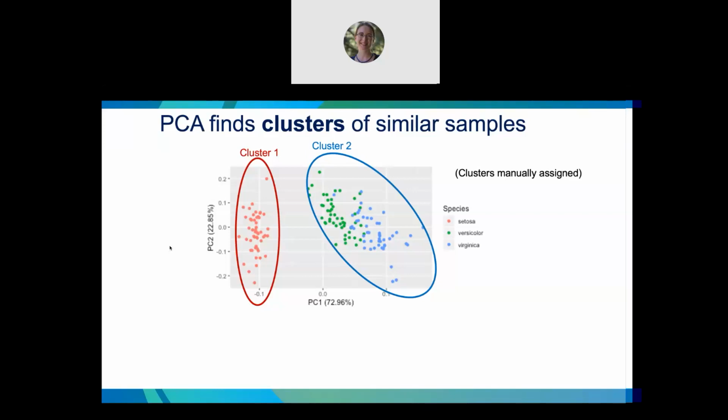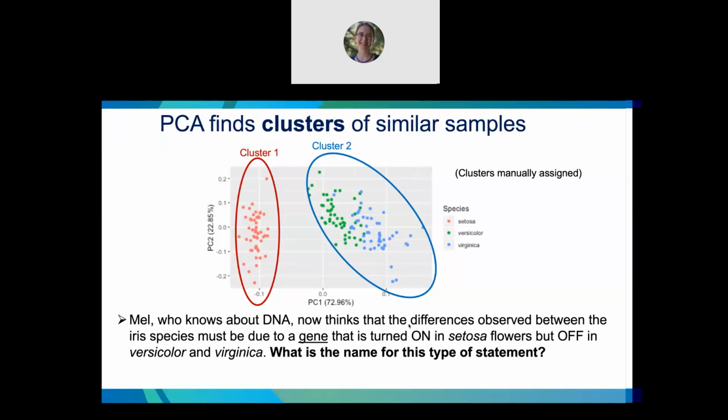So it's not as if the two variables are on the X and Y axis. You would say, oh, well, it's because Setosa has much shorter leaves or whatever. And so I generally use PCA plots as a way to ask these questions. What is causing the separation?